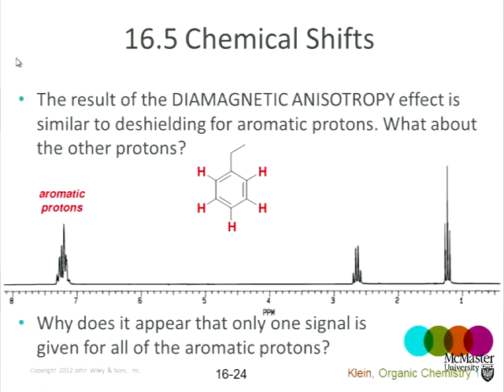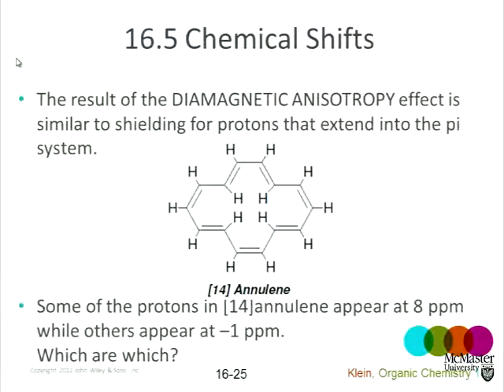So all of these different aromatic protons, they're not all chemically equivalent. The two at the top are equivalent, the two at the middle are equivalent, the one at the bottom is different from the top and different from the middle, and so we see a whole slew of signals. But notice that all of these aromatic protons are slightly different, and yet they all come at roughly the same chemical shift, okay? And that is where we expect protons in aromatic systems.